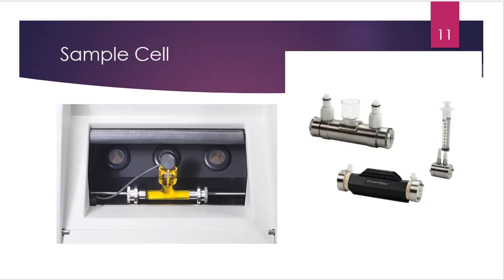Here is a picture of inside of the polarimeter, maybe a little bit closer. The position of the sample compartments in these polarimeters doesn't really matter. You can put them in the middle if that's where you like, and that's typically where I do them. Or you can push them over to the right-hand side, or to the left-hand side. The only thing that I would say is just be consistent with it as you begin to run samples in a polarimeter. You don't want to be changing the location of that polarimeter cell over and over again. It should not make a difference, but just in case, I always like to play it safe. I also think that putting it in the middle gives me a little bit more wiggle room and freedom on either side for things like these little temperature probes that need to go into the solutions.